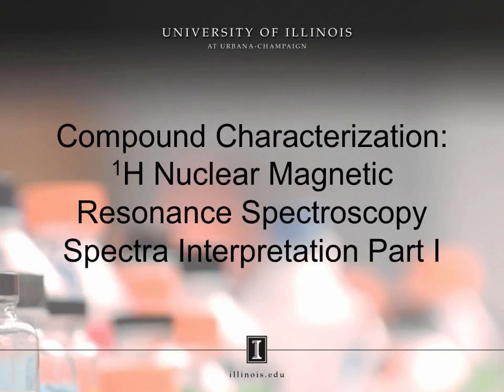Compound Characterization, Proton Nuclear Magnetic Resonance Spectroscopy Spectra Interpretation, Part 1. In this webcast, we will discuss how to interpret Proton NMR spectra. What information can we gain from it, and what can we use that information for?